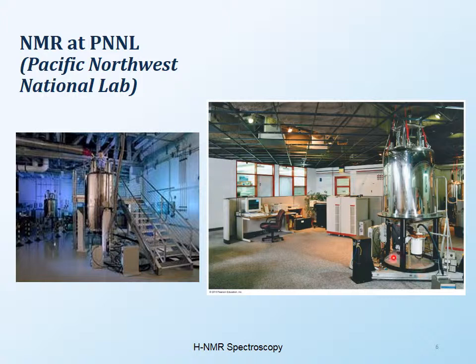They will be isolated because it's a magnet, and you should not have your credit cards there. You should not be wearing a pacemaker when you go to the instrument, because all of these things will be affected by the very strong magnet. So when you work with NMR, you really have to be trained properly in order to work with it. But anyhow, it's a really cool instrument.